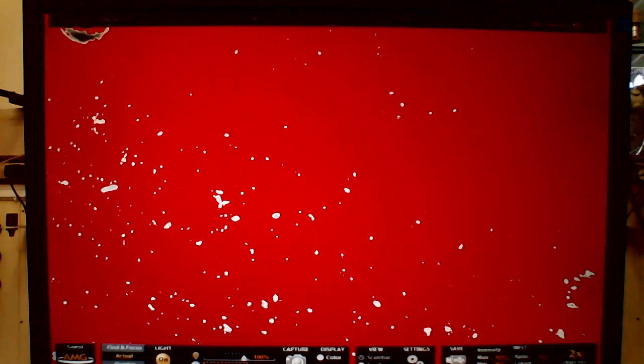I don't know about the energetics of what you've described earlier. But certainly the bubble might. So now you can actually start seeing some ghosting effects, and this is essentially slowing. It's like going past a picket fence and seeing a car, and the wheels actually end up going backwards because of the strobing effect. So the frequency of the screen and the frequency of the refresh rate capture give you a strobing effect, essentially slowing time down. Right. But we're looking down through magnification, so we're actually going ahead in time, but then slowing it down.